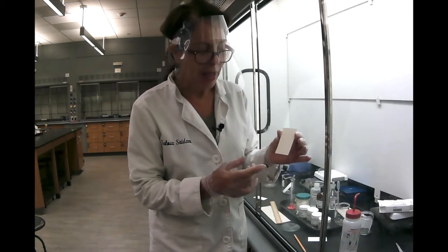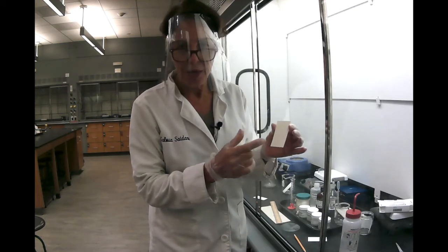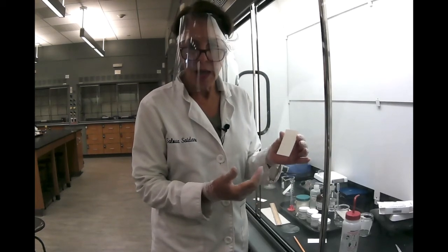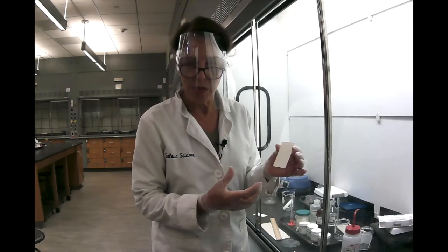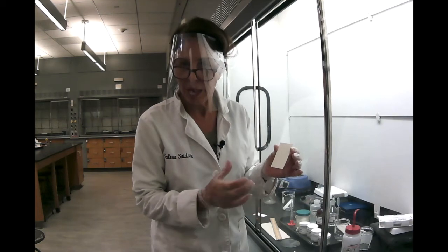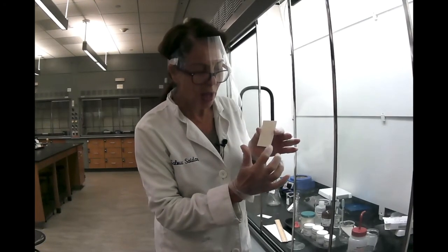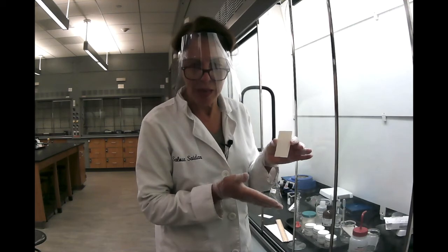So the idea is to put your substance on the stationary phase, which is a solid that will interact with your substance through intermolecular forces. And depending on the strength of the intermolecular forces, your substance can strongly adhere to that surface or weakly adhere to the surface. Now, what you also do is once you have your substances on the surface, then you're going to use a liquid phase that will push it up.